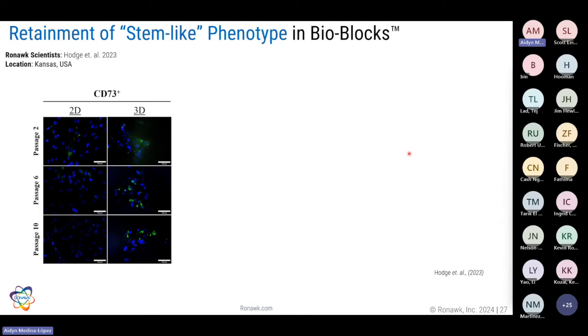All of this data that I'm showing here has been done both with fluorescent markers and PCR, and you can find them at the end of the presentation. I will have all the listed references for them.